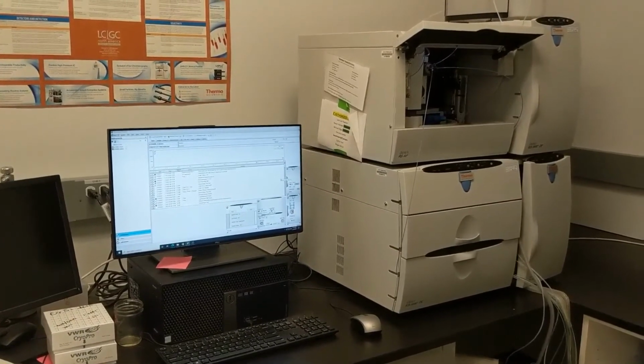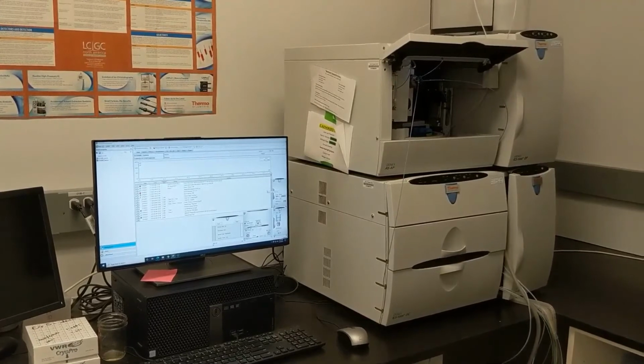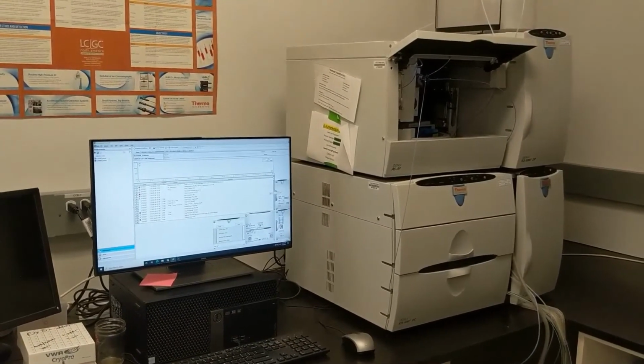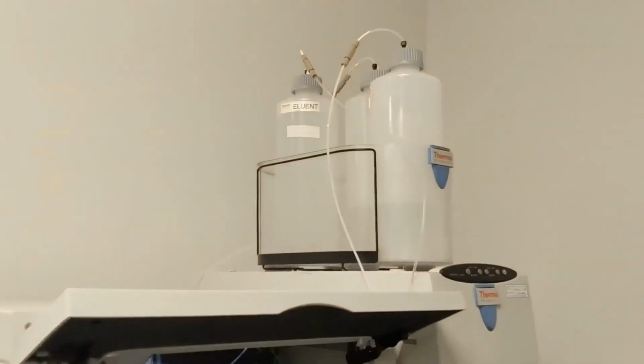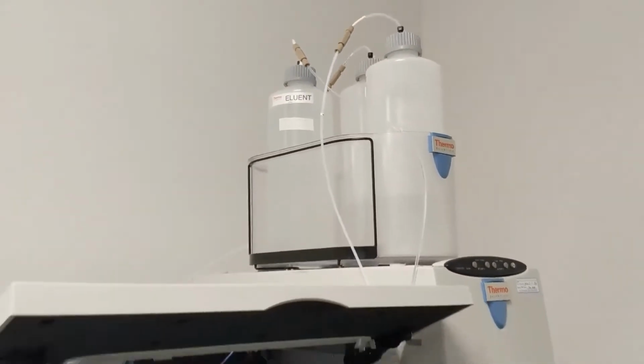Okay, so now we have to get the IC ready to run. And the IC is going to take a little while to equilibrate, so we want to get this all set up before we start creating our run program. The number one thing that you need to pay attention to before you run the IC is those bottles of water up there. Now these have been running for a little while, so you can see that they're almost empty. These need to be filled with nano pure water.